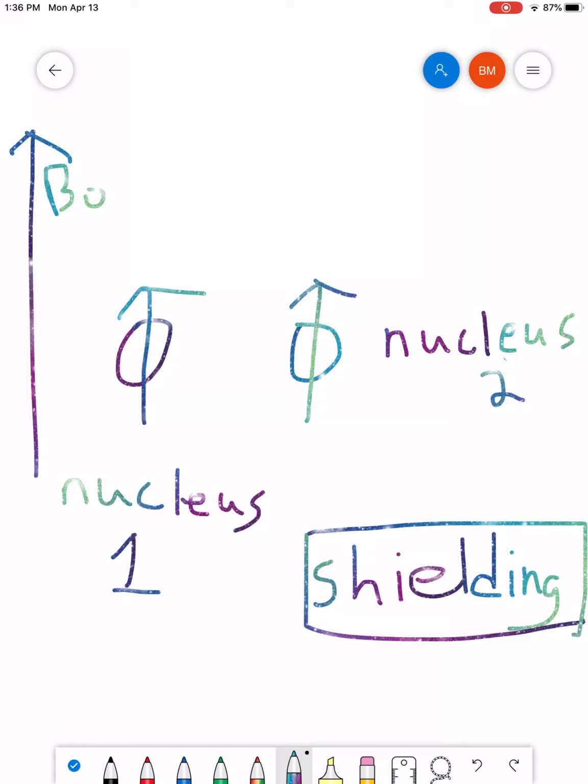In other words, the magnetic field from neighboring protons helps to shield the neighbors from the big external magnet. All right? And as a result, they don't feel the external magnet quite as much, and they're not quite as rigidly held into place. Right? So, if you have something that's really, really shielded, I'll see if I have enough room here to write this.